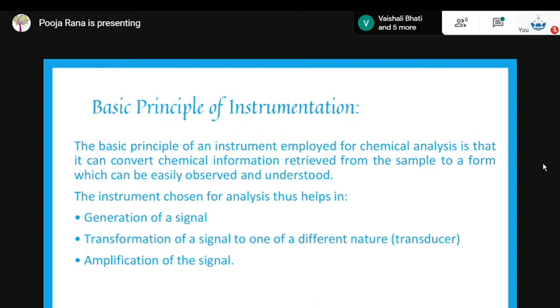So what we do is, we take a part of that particular sample, we keep it for analysis of blood group and species determination, and the rest of it is sent for PCR. It is subjected to PCR amplification. So the sample is amplified. Whatever DNA is present in it, whatever material is present in it, would be amplified, and thereafter the qualitative analysis of DNA would also be done.